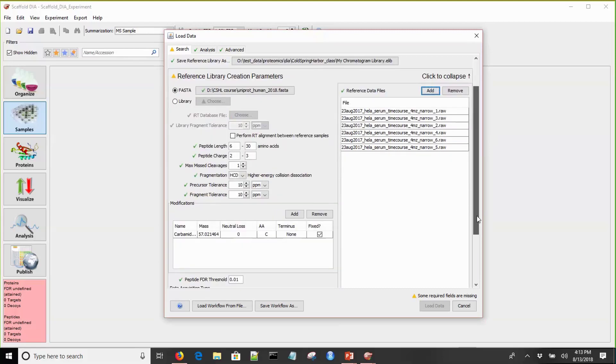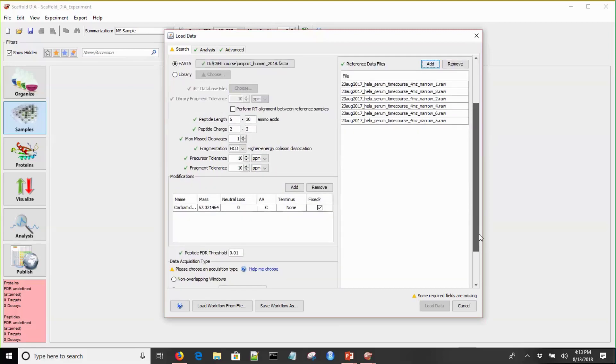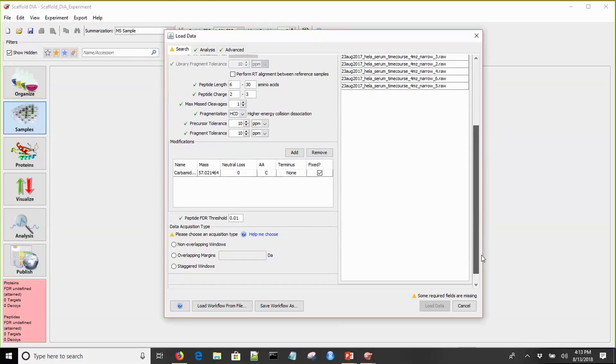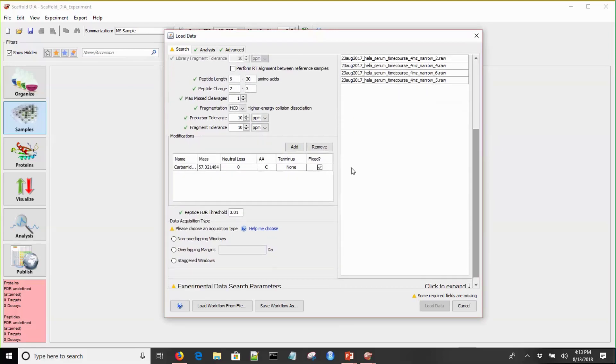Next, you can define any modifications of interest. The last thing I want to talk about is the peptide FDR threshold. It's important to set this properly here because once you set this and the data is processed, you cannot change peptide FDR threshold. This is set to 1% by default.